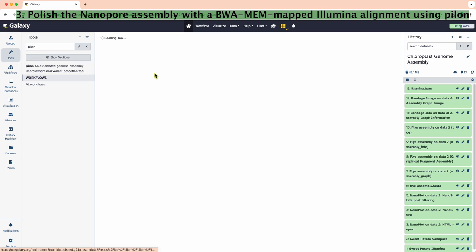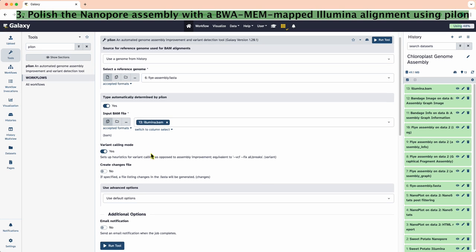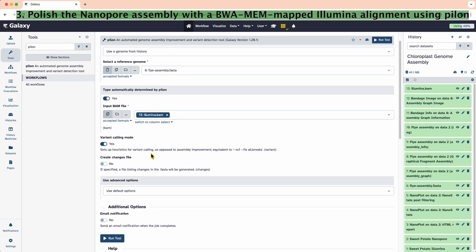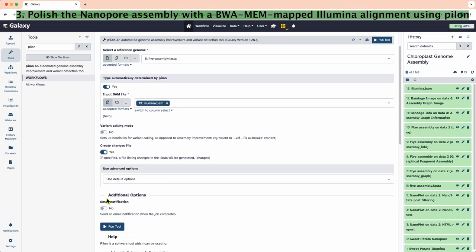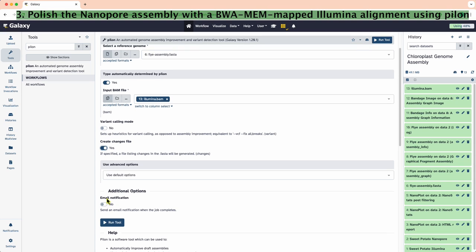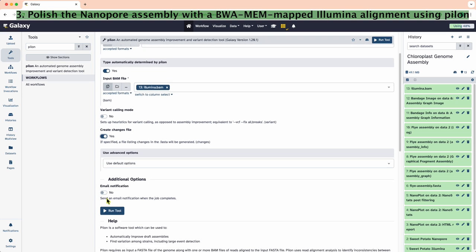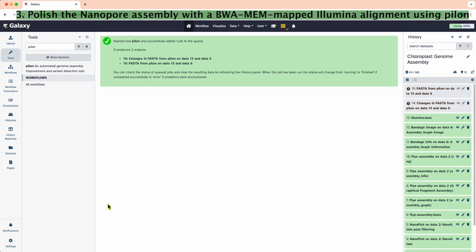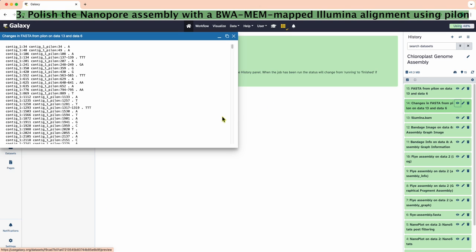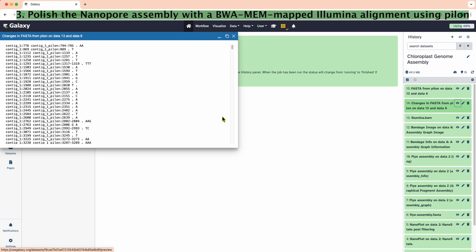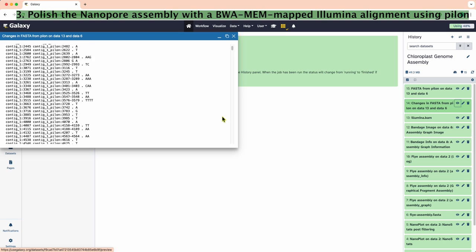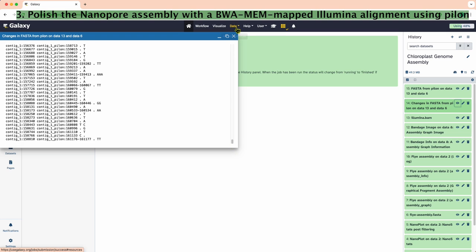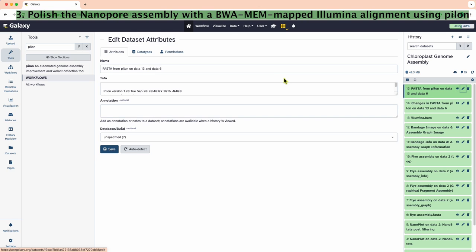Pilon does the actual polishing. We will not use the variant calling mode, but we will create a changes file. The rest of the settings look fine otherwise. The changes file will show the differences before and after polishing. We should rename the fasta output to polishedassembly.fasta.